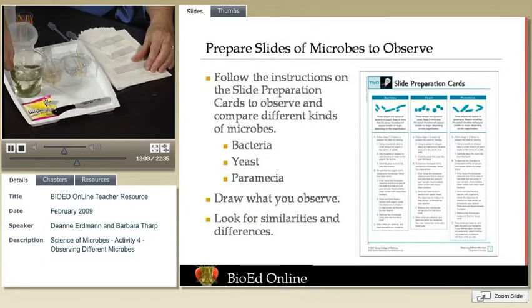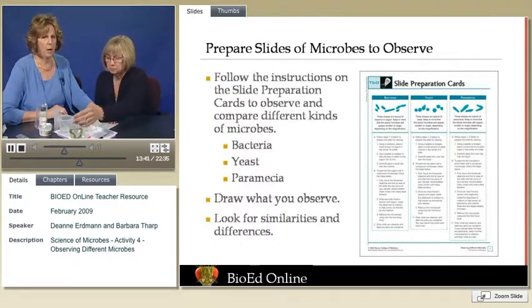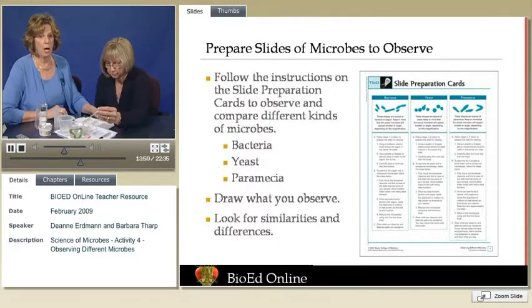Right. And this particular container, I also have a little bit of an aquarium plant in there. But we were lucky in that we have a science center near us in the Houston Independent School District, and we can easily get cultures of Paramecia. You can order these from a Biological Supply House too if you don't have that kind of a science center in your district, and they're very easy to maintain. But I do recommend, if you want to see a large number of Paramecium, going ahead and ordering them. If you get ordinary pond water, most of the time you can find a number of Paramecia, but to make sure you have a large colony, you may want to order them.